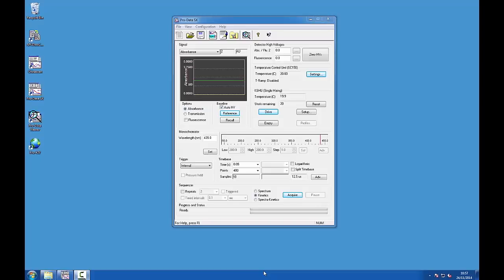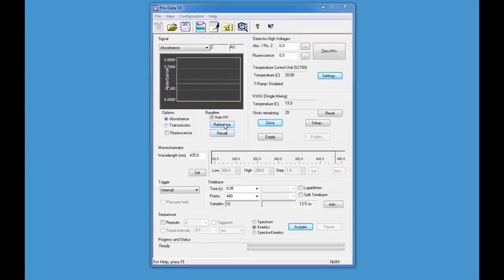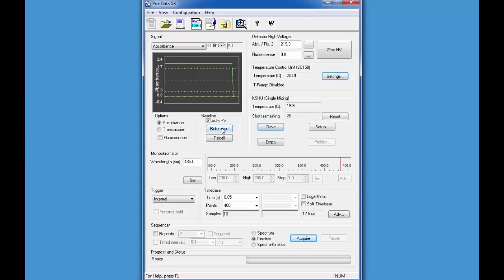For most experiments we want the gain to be optimized automatically, and we therefore tend to keep the auto HV button checked and then press reference. A high voltage that optimizes the recorded signal will automatically be set depending on the amount of light that is hitting the detector.